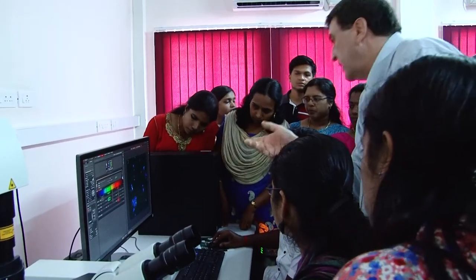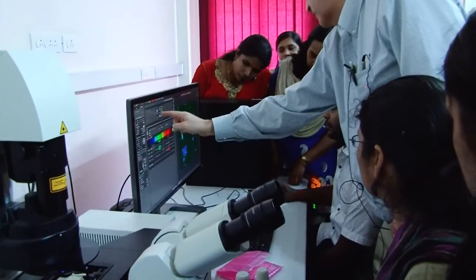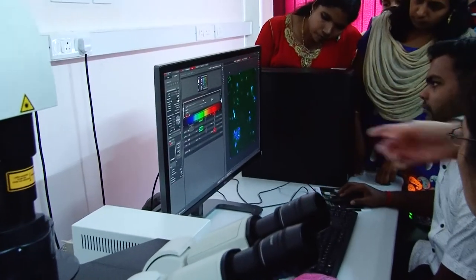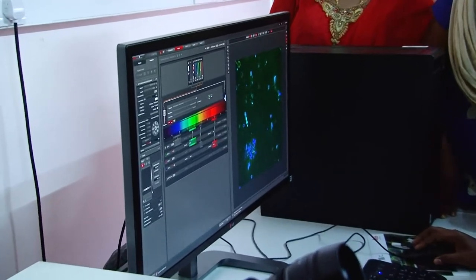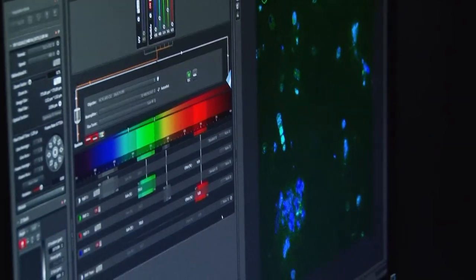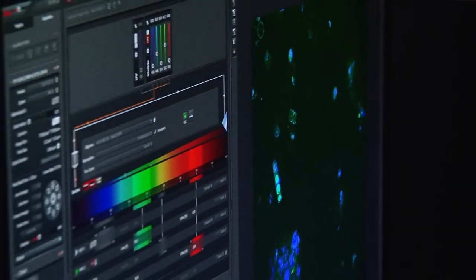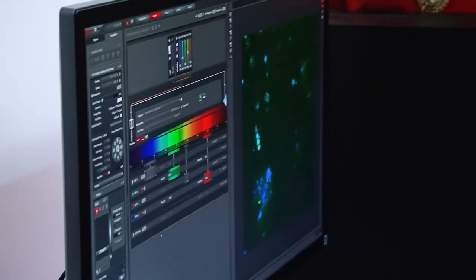Okay. So what he's doing here, even though it's a red laser, we're using pseudo-colored blue, and then green, we're using pseudo-colored green. Okay, so what we're gonna do is I want you to go up. We're gonna try to image this one. So I want you to come, now I hope it's like mine. I want you to spin this a little bit in the counterclockwise direction. Okay, and then I want you to pick the top when you think it's the top. Okay, let's call that the top.